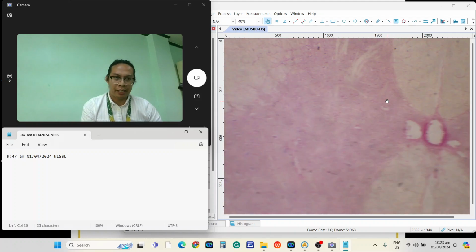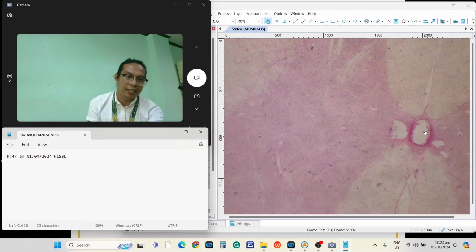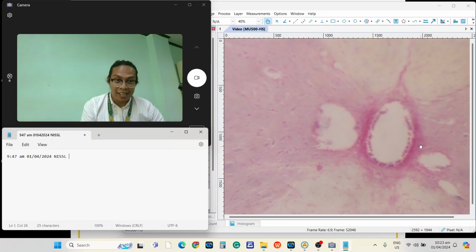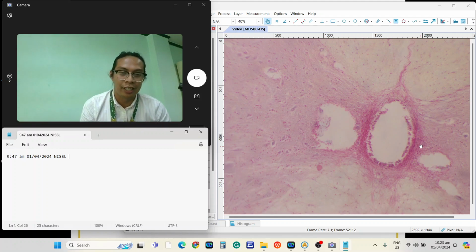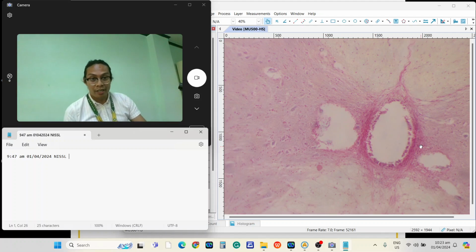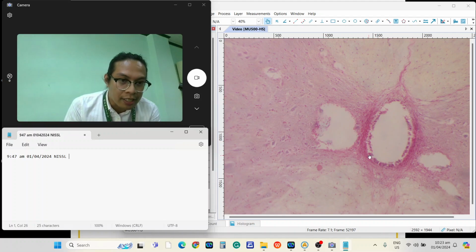Now, hindi ko pala nabanggit. Ano yung nakikita natin sa gitna? Bakit siya may butas, may kanal sa gitna? Ano kayong tawag sa kanya? Simple lang. That is known as the central canal. Okay, so that is the central canal. That central canal is in communication with the ventricles of the brain. Di ba? Diyan, naglalaman ng cerebrospinal fluid.